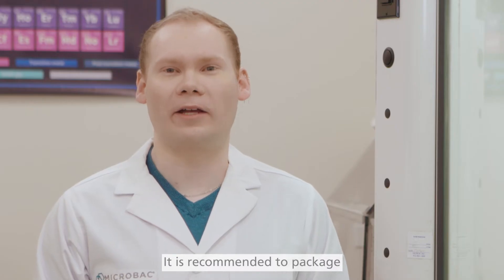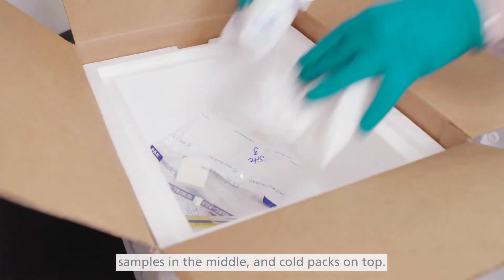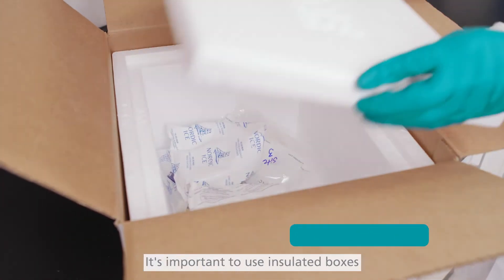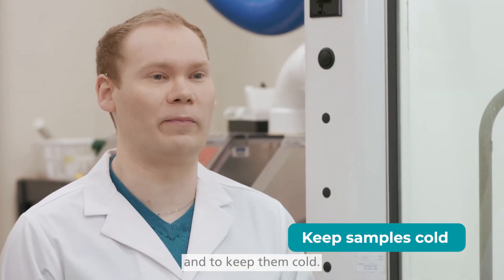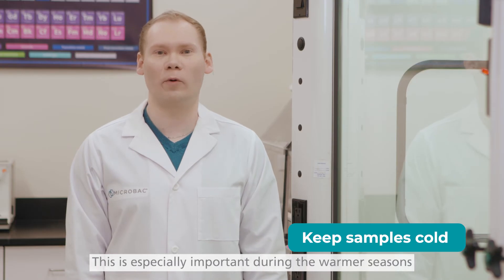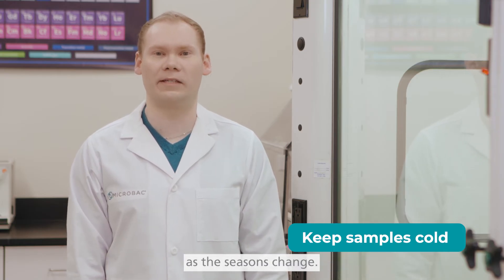It is recommended to package using what we call the sandwich technique, with cold packs on the bottom, samples in the middle, and cold packs on top. It's important to use insulated boxes that are the appropriate size for the amount of samples and to keep them cold. This is especially important during the warmer seasons — make sure to use more cold packs as the seasons change.